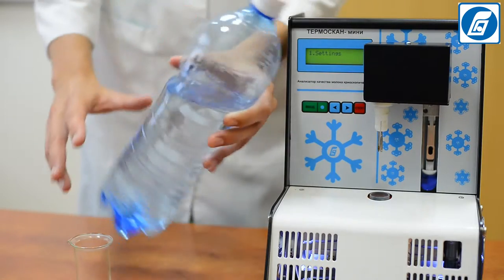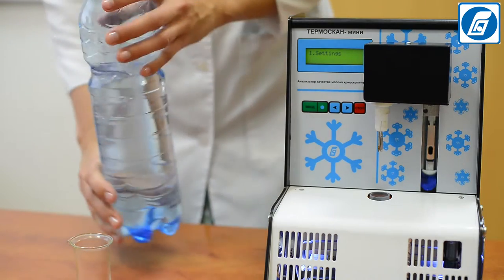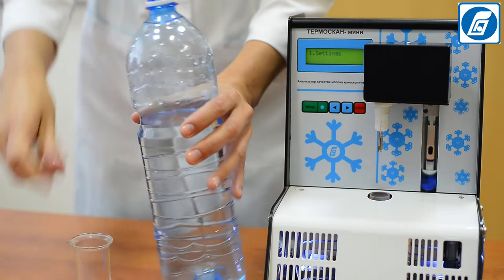Additionally, you can order a set of special solutions for checking the analyzer's operation. If required, these solutions can also be used for the analyzer's calibration.